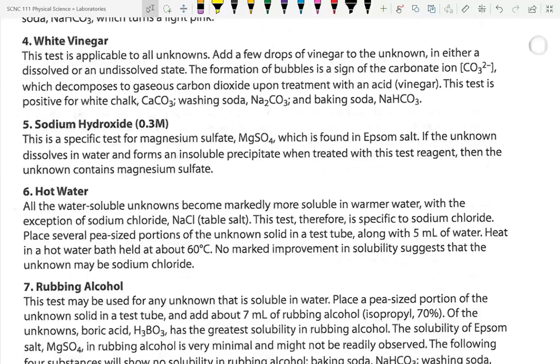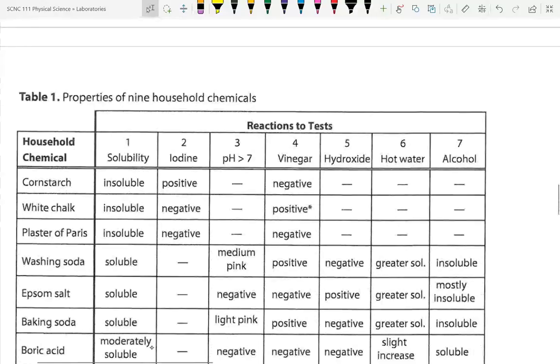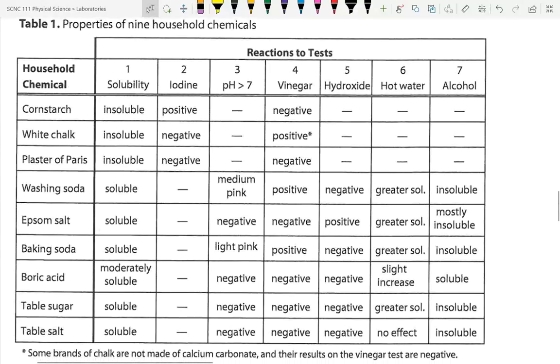Now, I will warn you, don't say, well, I don't need to do test B because I already have identified the sample that test B would have identified, because you could have made a mistake in interpreting your result. So do run through all of the tests you need, even if your order says, well, I've already found this one, so after running test A, it has to be this. But we don't want to run extra tests that would not be called for. So the first thing you need to do before we get started is, based on the information in this table, make a flow chart of how you're going to do some testing.